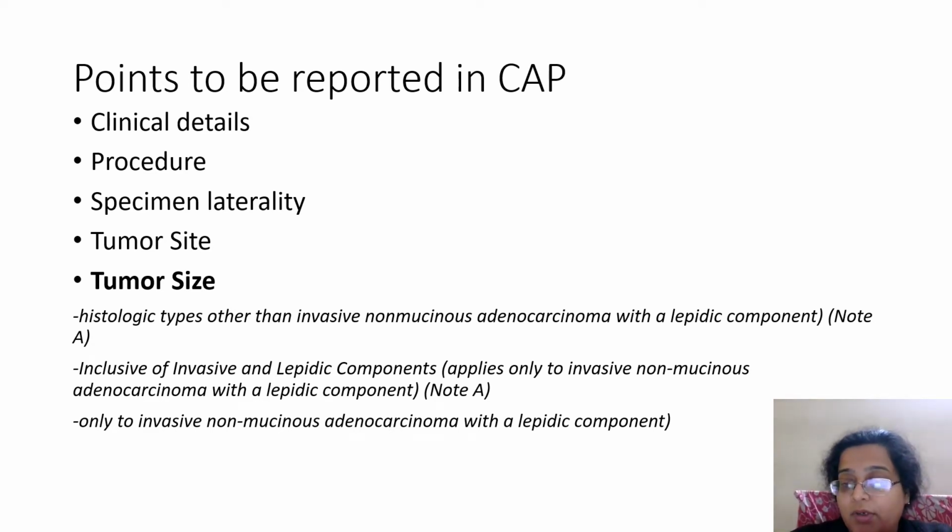Apart from testing for floating, sometimes we squeeze a part of the lung to see if air bubbles are coming out or not. If it is solid, dense, wet, and no air bubbles are coming out, it might be due to drowning. Then there may be hemorrhage, etc., in the lung. So pink frothy bubbles might come out if you are squeezing some part of the lung. So these are some very practical gross things that you do when you look at the lung.